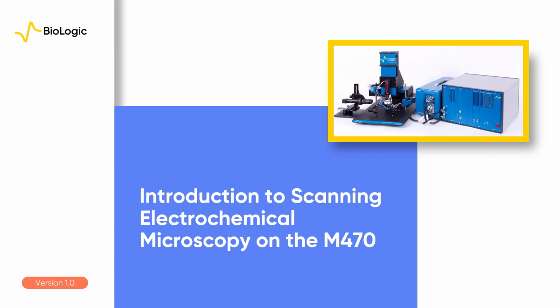Since the introduction of scanning electrochemical microscopy, or SECM, in 1989 and its commercialization in the 1990s, its use has grown sharply, making it the most popular form of scanning probe electrochemistry. This popularity has seen SECM used in fields as diverse as batteries, biology, and corrosion. During this video presentation, we will introduce SECM in its many forms and its use on BioLogic's M470 scanning electrochemical workstation.